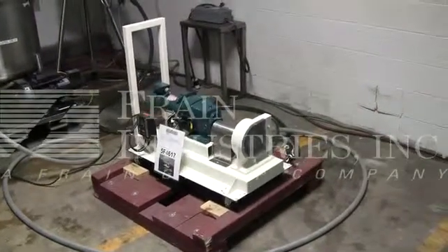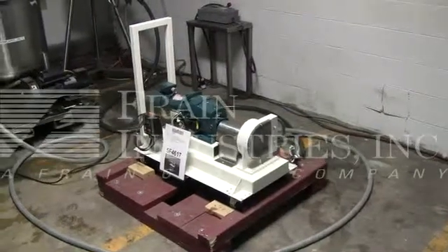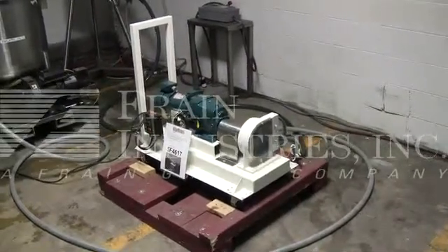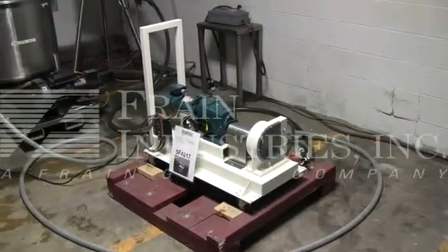The machine is currently set for single phase, 60 cycle, 120 volts. I recommend a field service technician to assist you with the startup and training on the machine. Please contact our field service manager to meet your field service requirements.